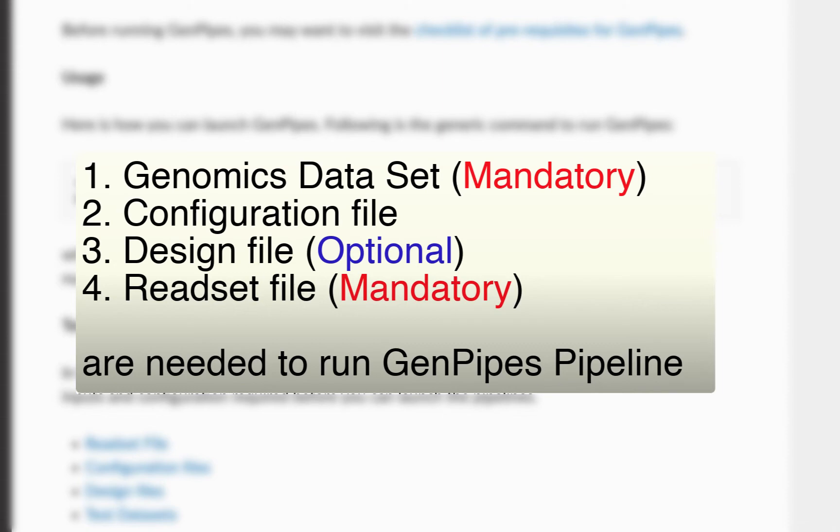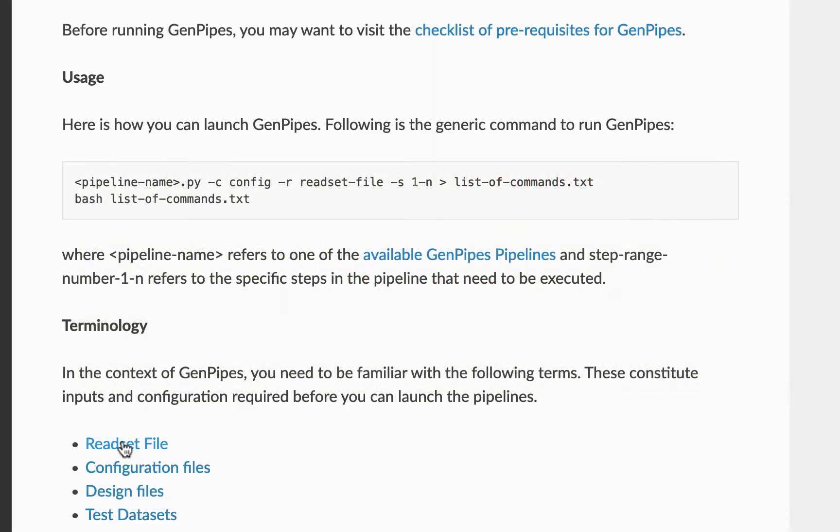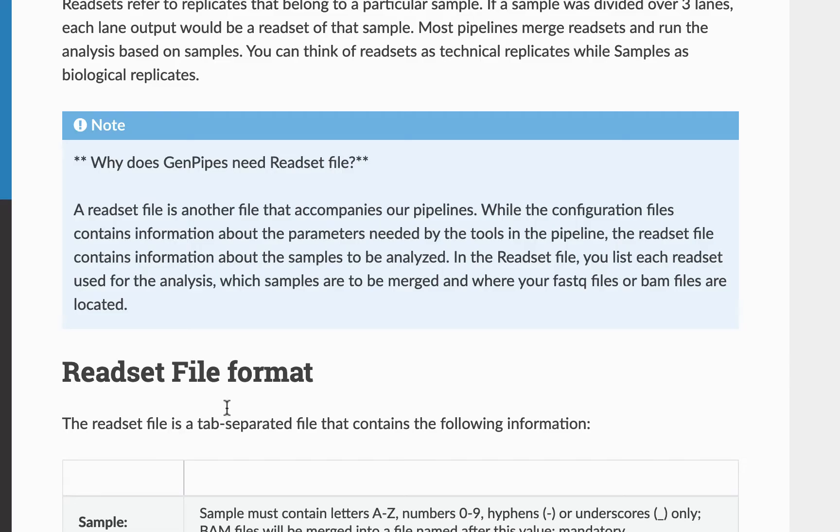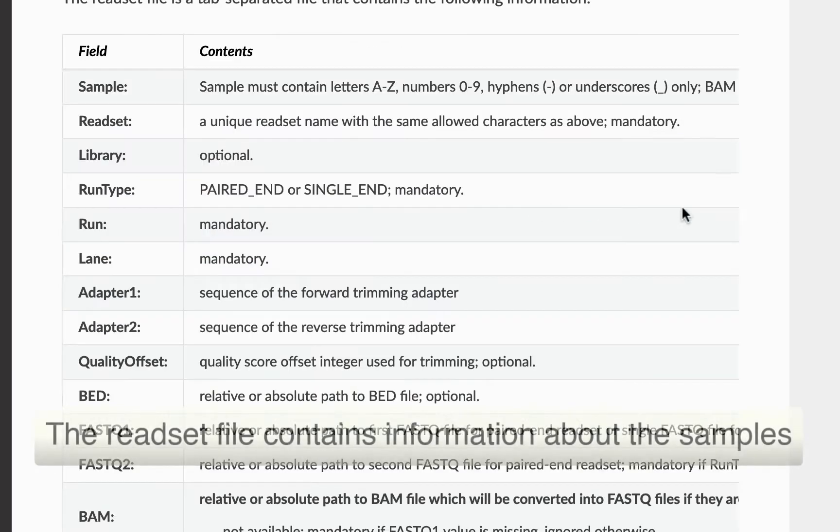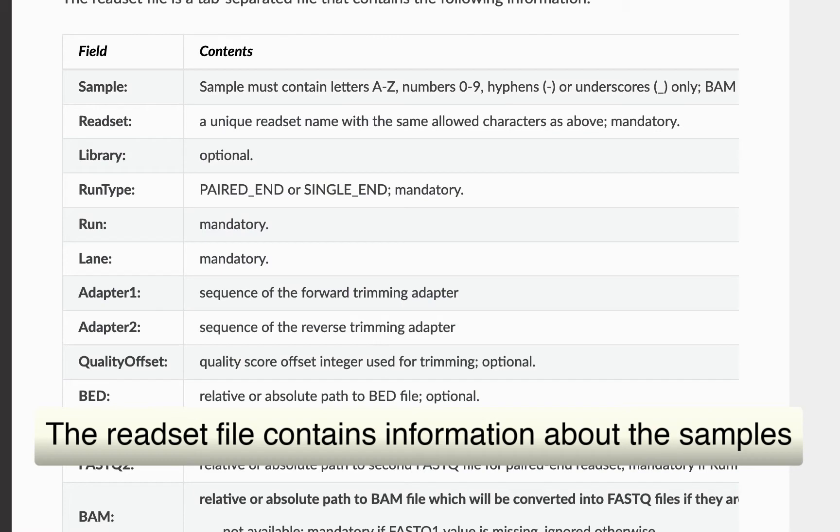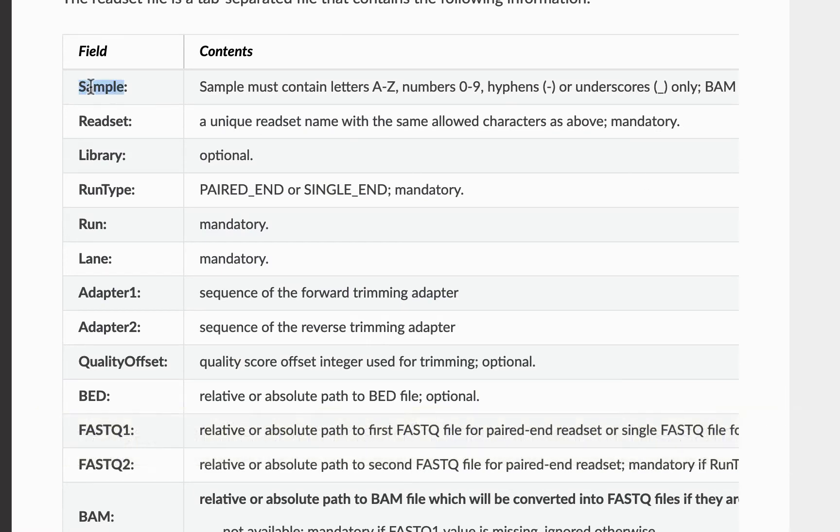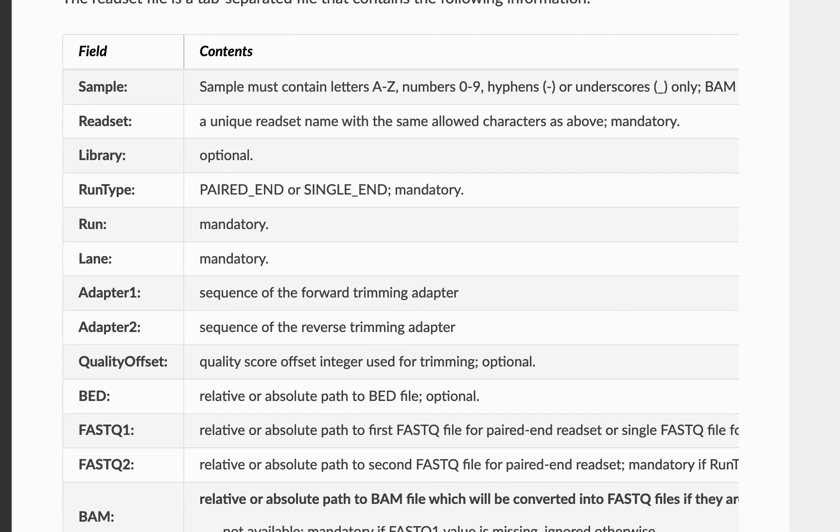Amongst them, the readset file is mandatory. The readset file contains information about the samples to be analyzed. Read sets refer to replicates that belong to a particular sample. Most pipelines merge read sets and run the analysis based on samples. In the readset file, list each read set used for the analysis, which samples are to be merged and where your FASTQ files or BAM files are located. GenPipes can aggregate and merge samples when indicated by the readset file.